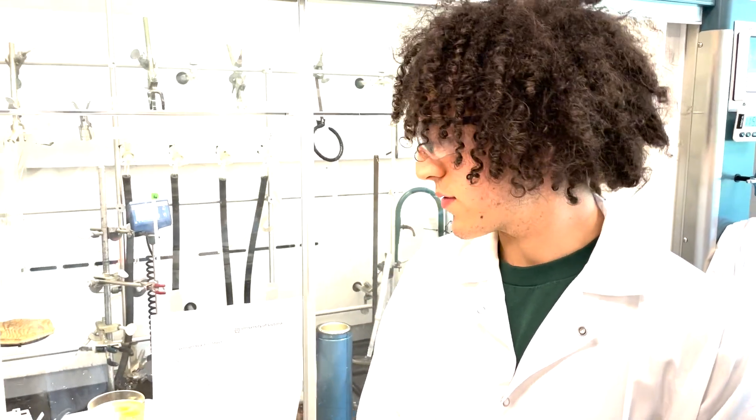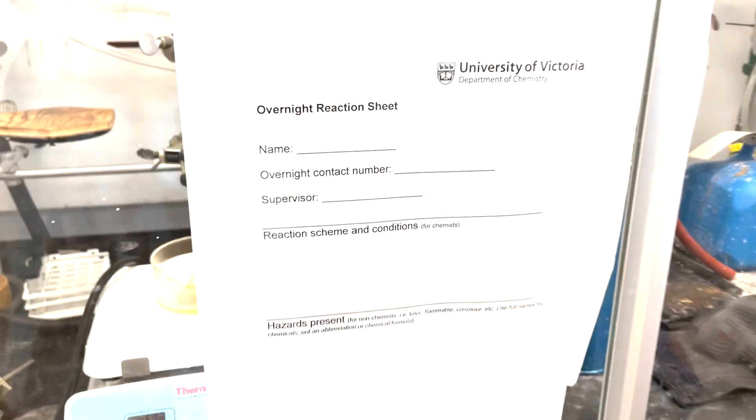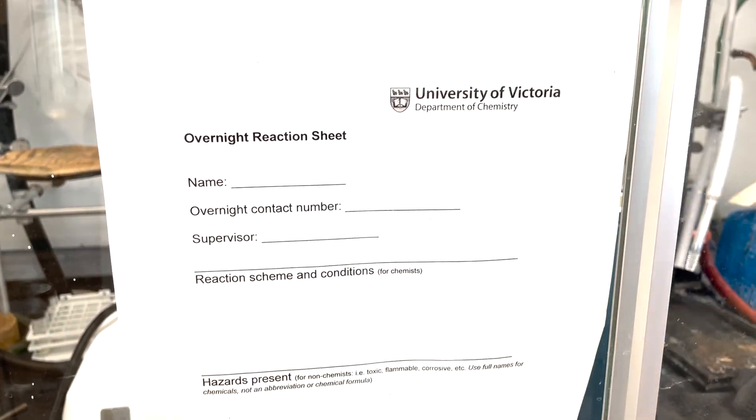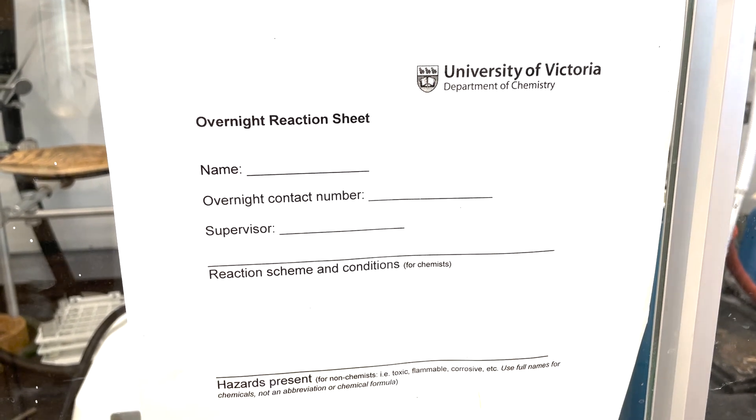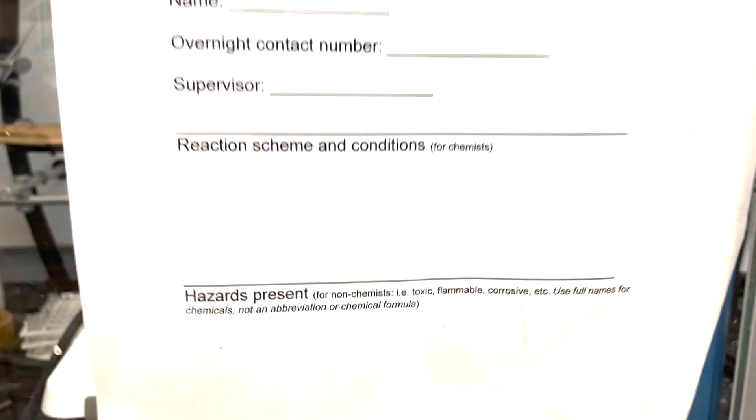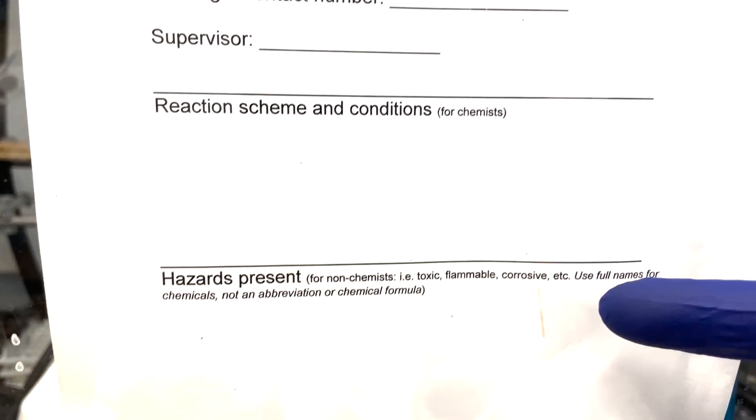If a fume hood is used for overnight reactions, it is needed that an overnight reaction sheet is filled out with your name, your contact number, your supervisor, and all hazards listed with WHMIS terminology.